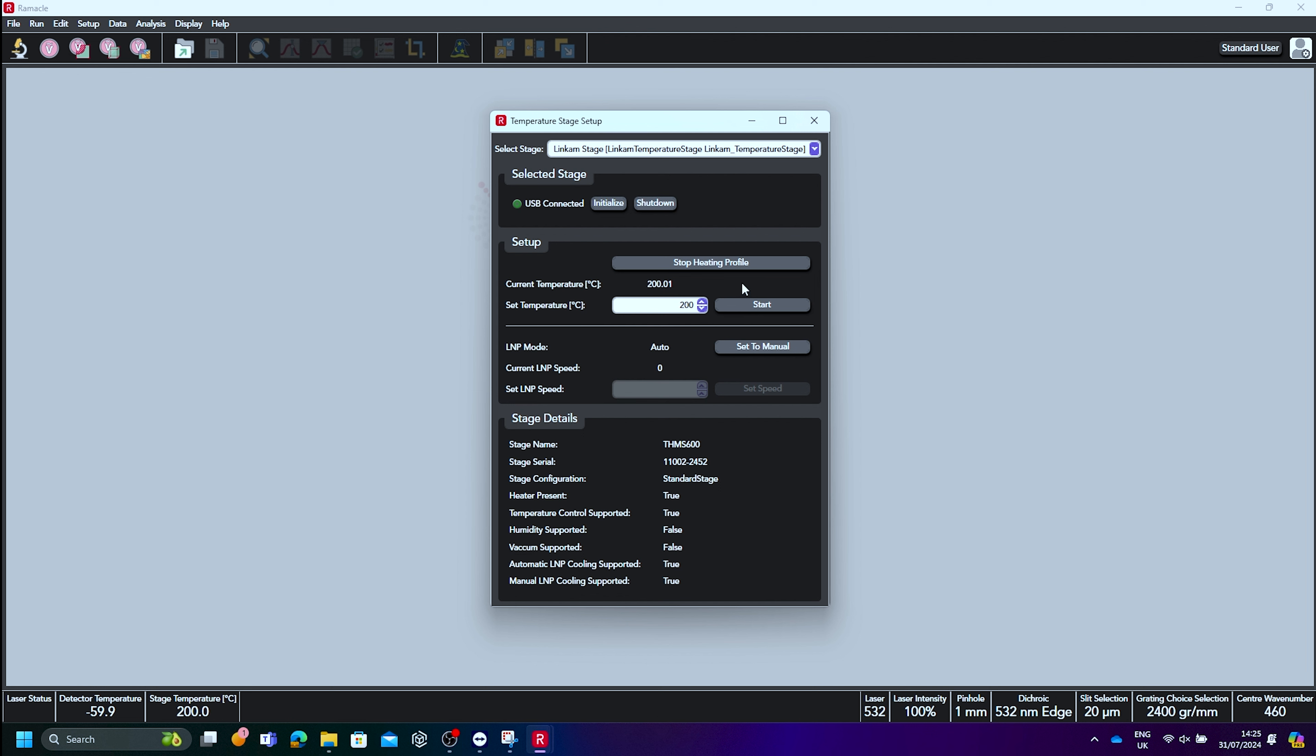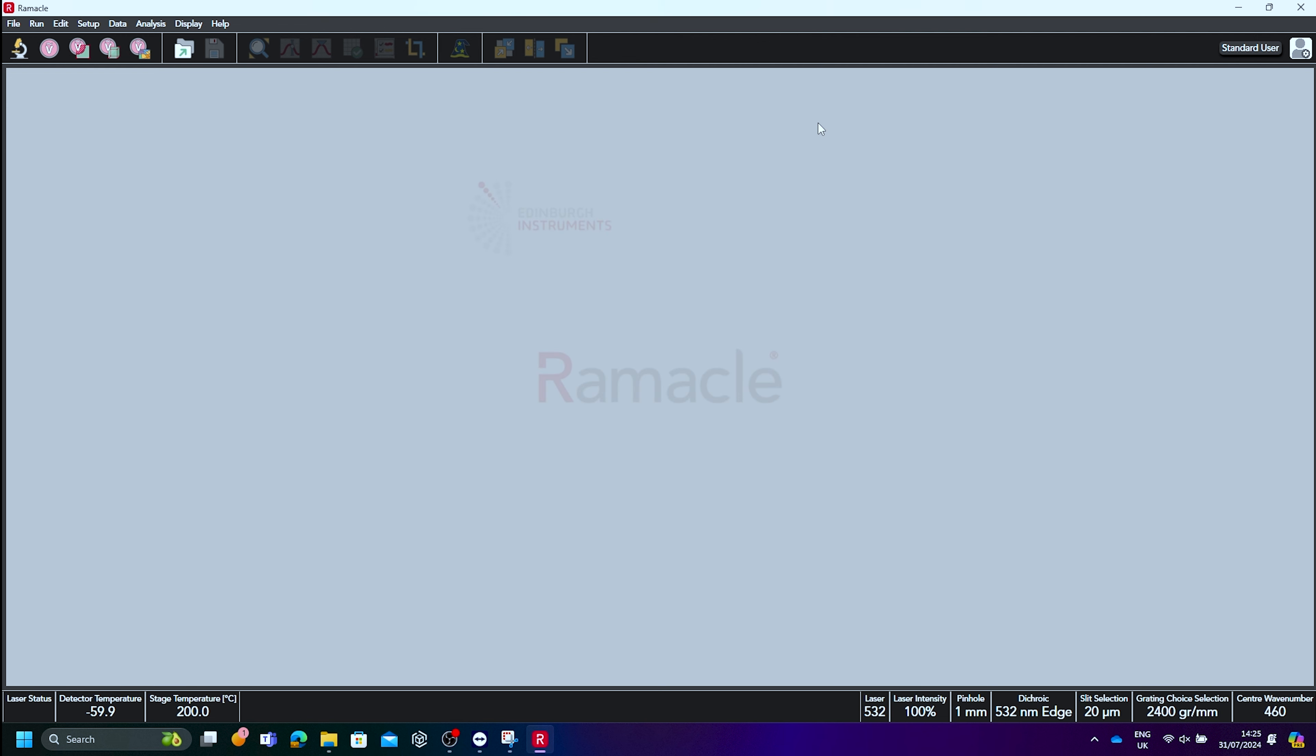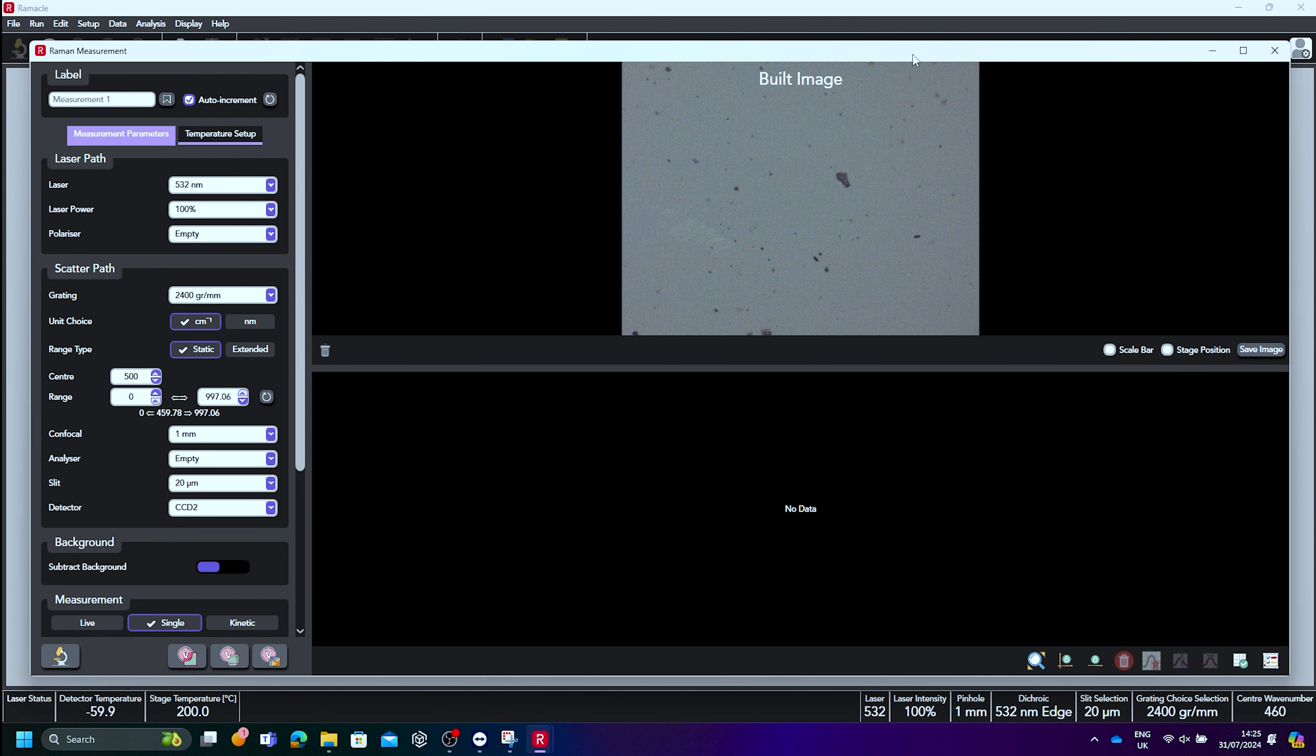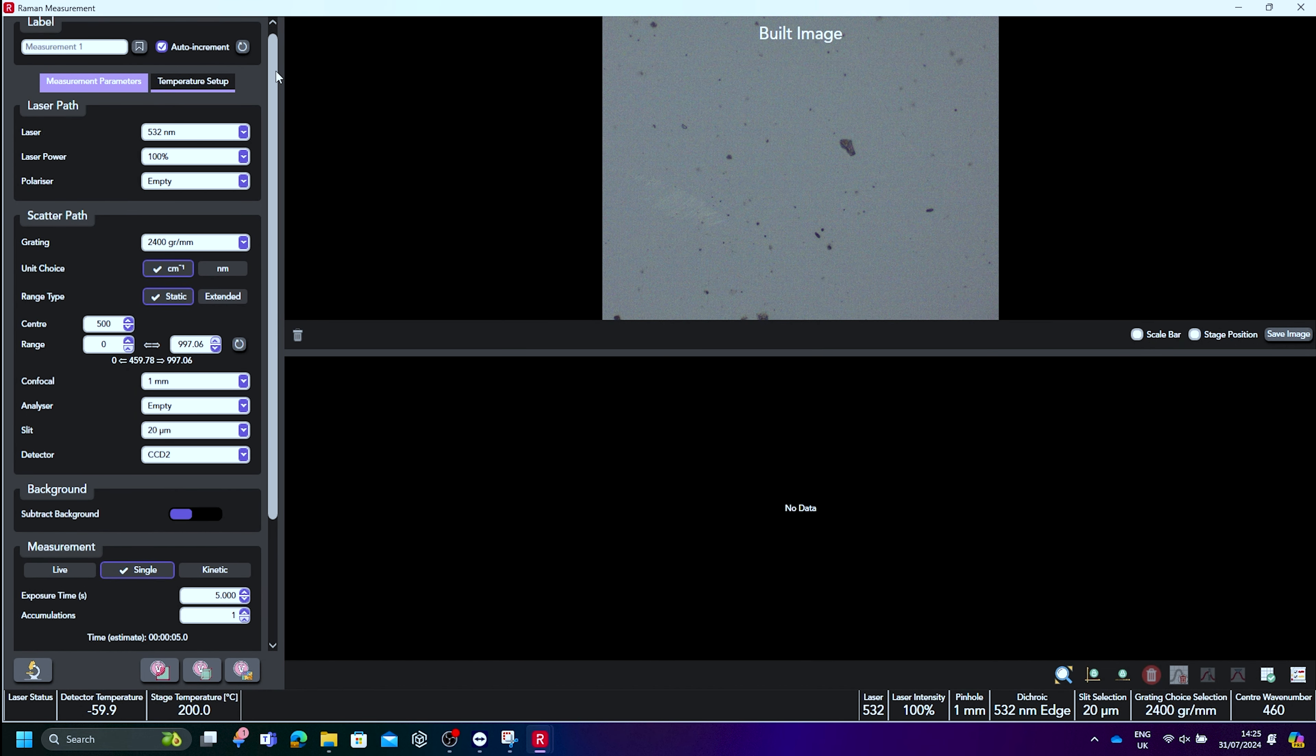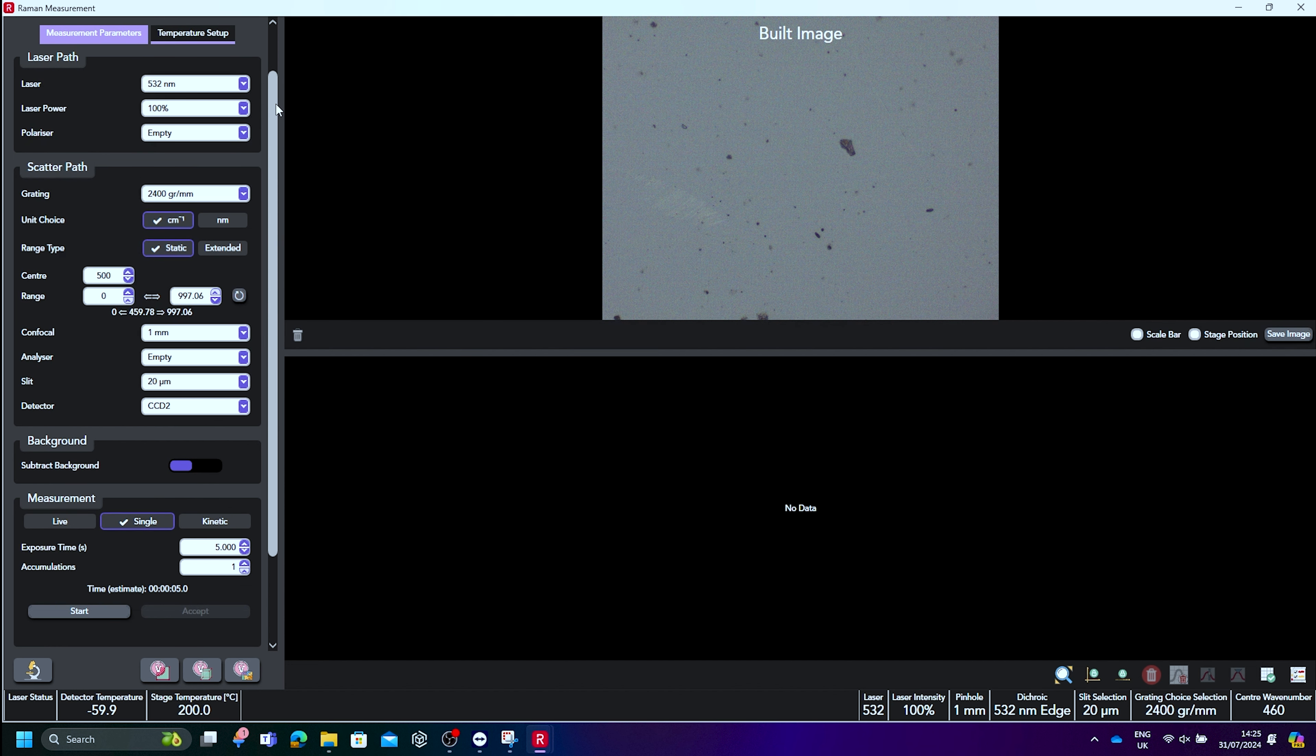In the Raman measurement window, we can now set up a temperature scan. Our measurement parameters have been preset, but we will use a 532 nanometer laser and a high groove density diffraction grating in order to obtain high resolution spectra of our silicon chip. We can also alter the range so that only the phonon mode of interest is being analyzed.